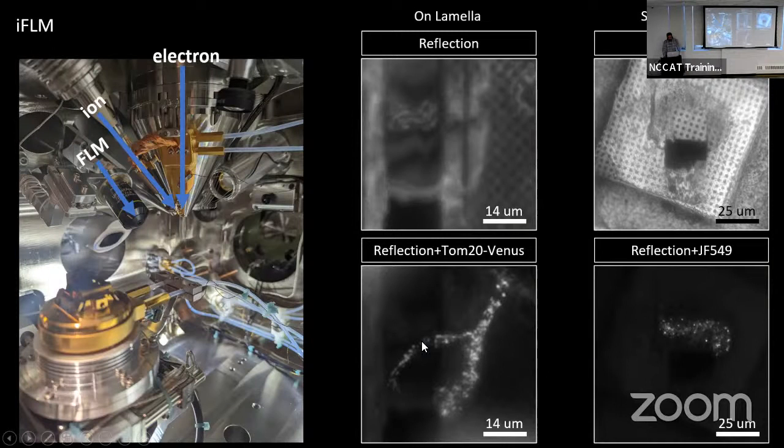So you can see where the mitochondria are in your lamella. Mitochondria are easy to capture in lamella because they're all over the place, so that's why it looks really nice. But if you're looking at something more sparse, the signal will probably be weak or not visible with the IFLM.